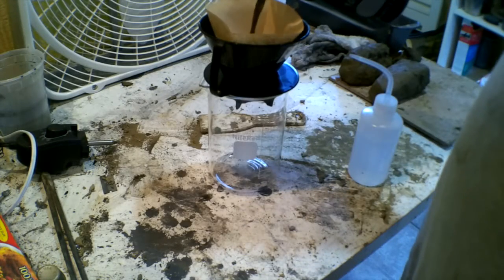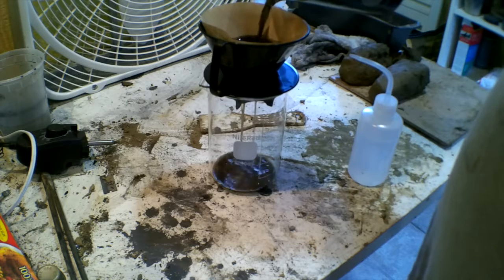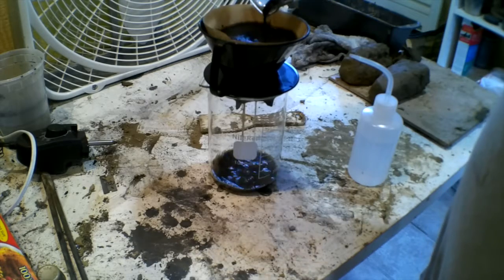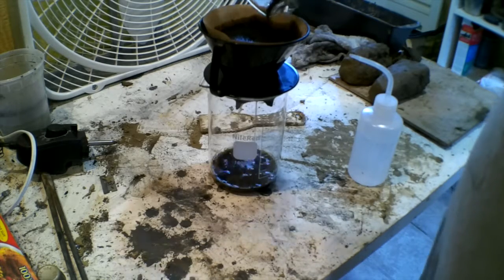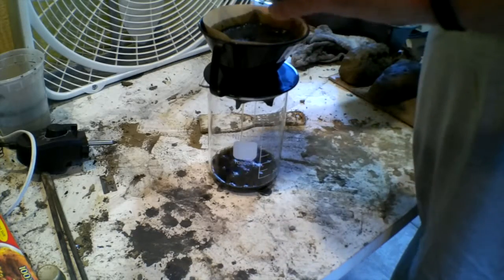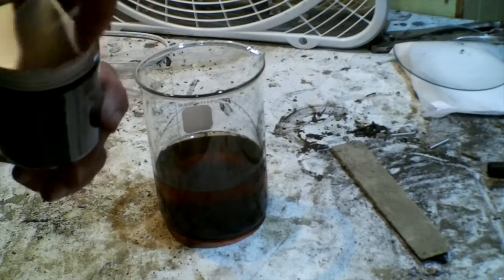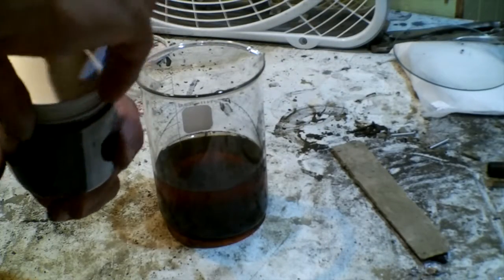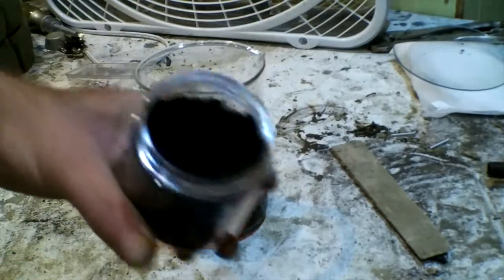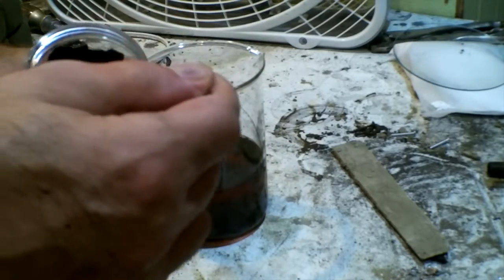Let's filter it off and see if I got anywhere. Well, not so much. In fact, I'm going to say that carbon actually might be causing me a problem. I might have gotten it more finely divided than I thought.